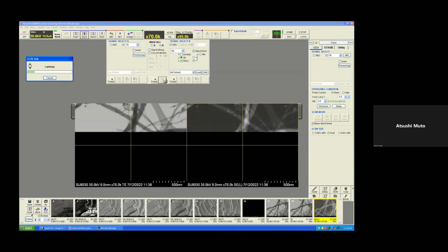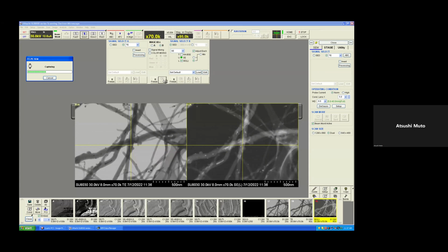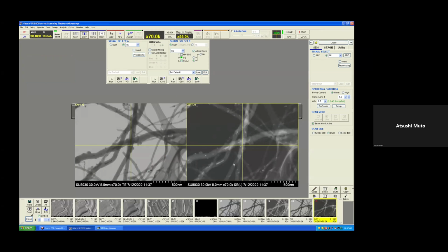The dark field image is kind of similar to the backscattered electron image. But if we try to get the backscattered electron image in this type of thin film sample, it is a big challenge because the backscattered interaction very rarely happens in such thin film samples. So it is more reasonable to utilize the transmitted, scattered transmission signal, to use the dark field to get the image. If you are familiar with STEM imaging, in the bright field you can get similar information, but the dark field is more focused on the composition.